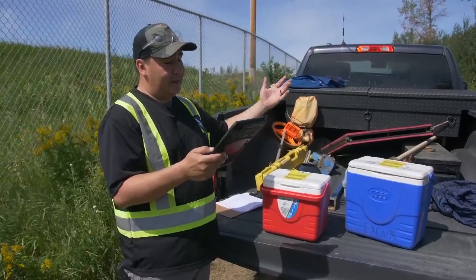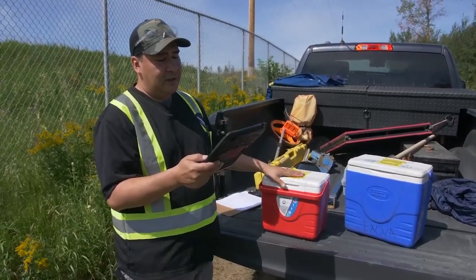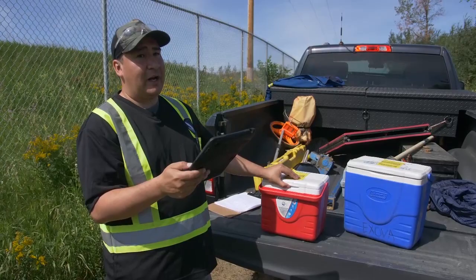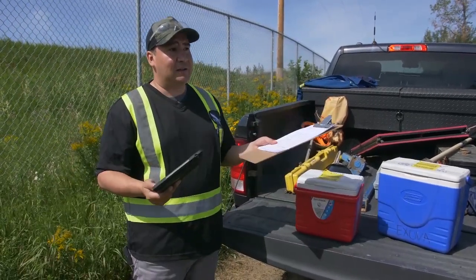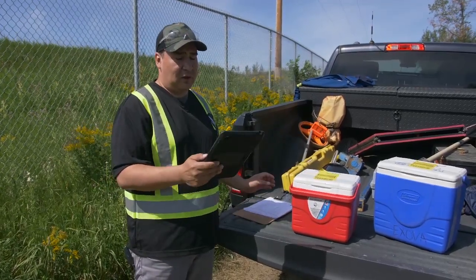It's also good practice for record keeping to take notes or photos about the weather and observations about your sampling point, such as strong winds, heavy rain or snow, and any faulty equipment or algae growth. That's why it would be good to do this inspection while you collect wastewater release samples.